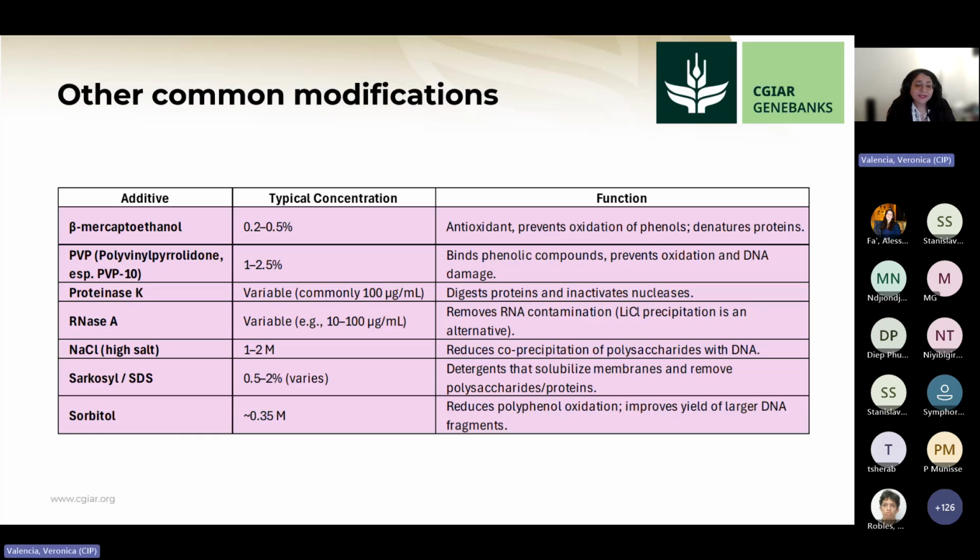But since sometimes we don't have the kit, what we found out is that if you use the sprout tips instead of leaves, you don't have any problems with oxalates from OCA. So these kinds of modifications help a lot with the setup. And so that would be examples of my experience.